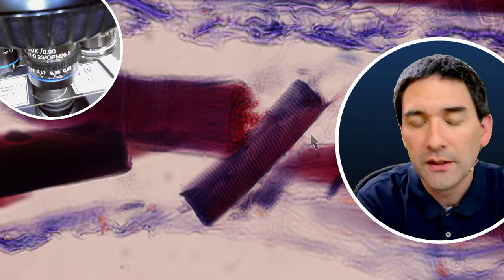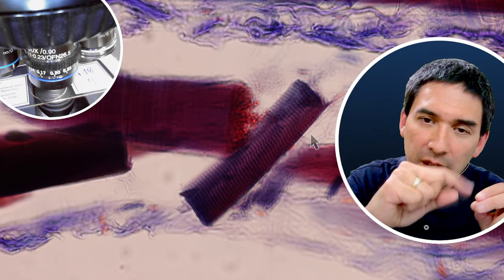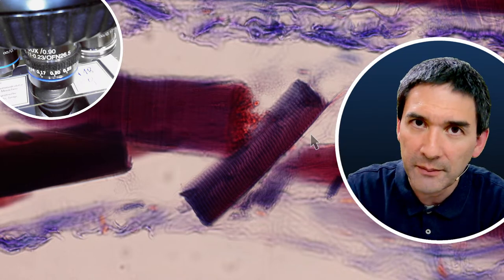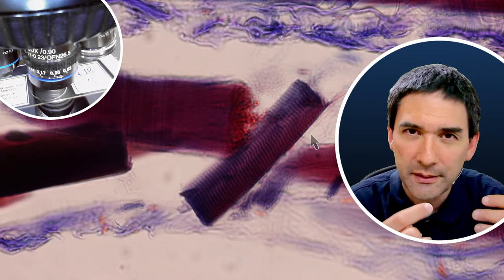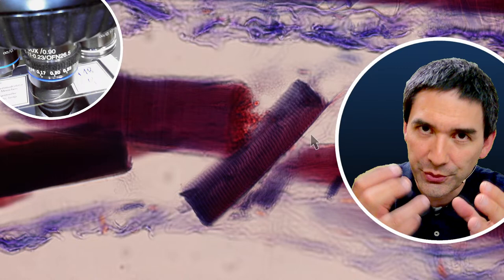Could you tell between fungi and chicken meat? Okay, the thing is the following: the fungi, it's the so-called aseptate fungi. I also made a video a couple of days ago. These are fungi which have long hyphae cells that contain multiple nuclei, a little bit similar to skeletal muscle, which are long cells which also contain multiple nuclei. And it's actually those fungi and the muscle cells that are a little bit special cases of the cell theory. Because normally we think of a cell having a nucleus, at least eukaryotes.